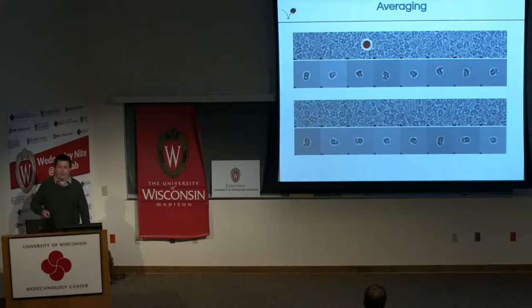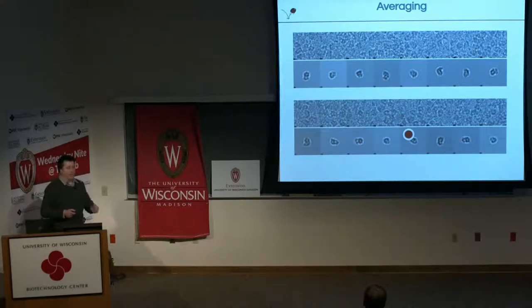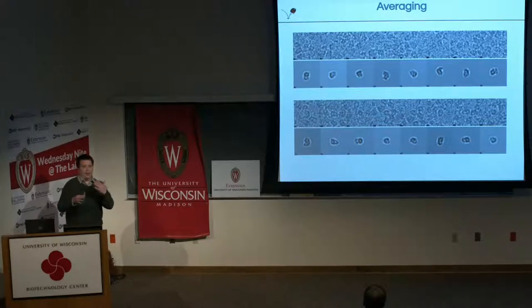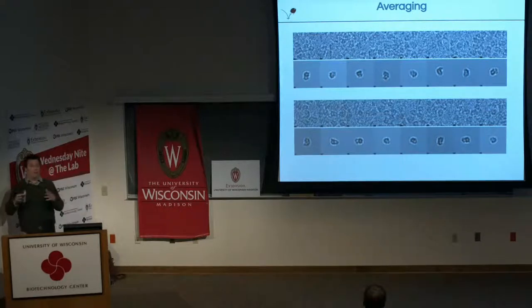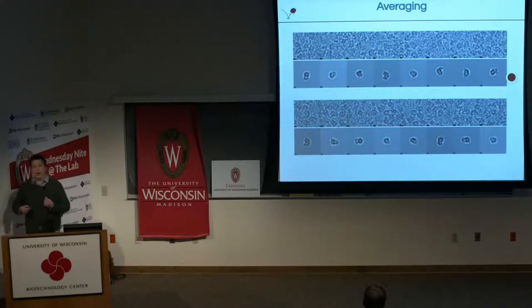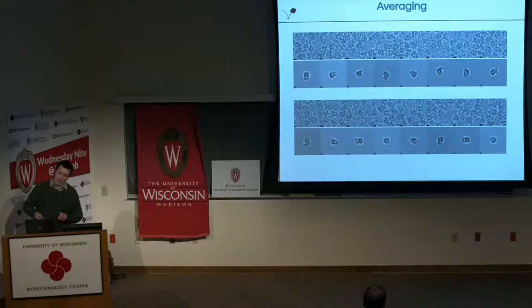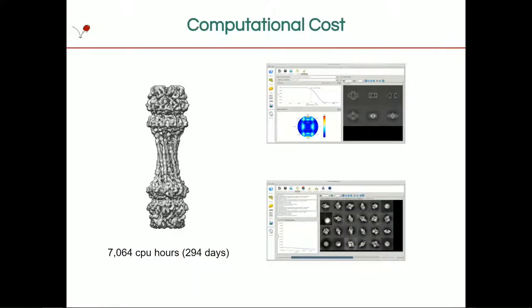And then you compare each of your images, each of these particle images, to those projections. You find the one that fits the best, and you say, okay, this particle is probably that thing from this angle, and we can start averaging in three dimensions. If you start with something that's wrong, you probably won't do that very well, but hopefully what you come up with looks better than the original one. And you can do this iteratively until you get to your final high resolution reconstruction. It's a reasonably computationally expensive thing to do, like I said. Essentially this angular estimation process is what takes most of the time.